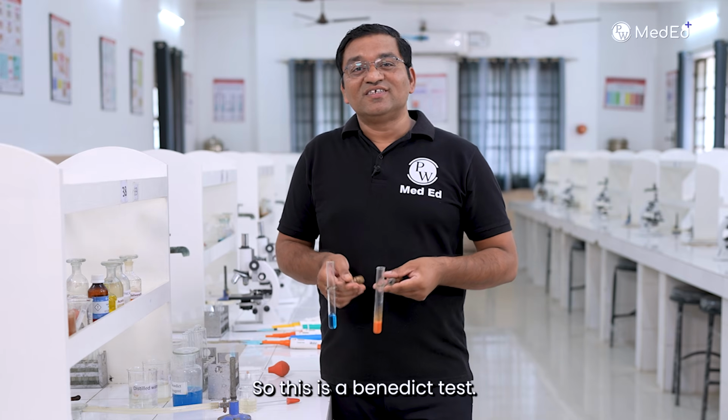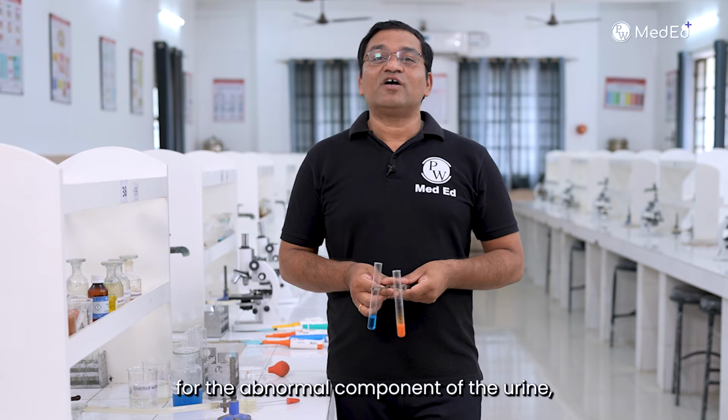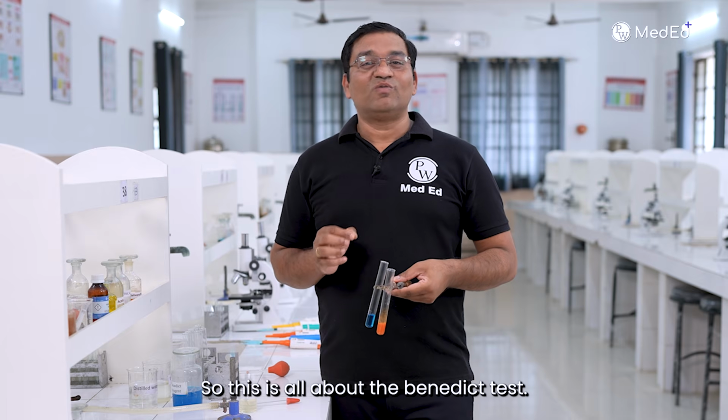So this is a Benedict test. It is one of the tests for the abnormal component of the urine, one of the 6 abnormal components of the urine. The glucose is there or the reducing sugar is there. So this is all about the Benedict test.